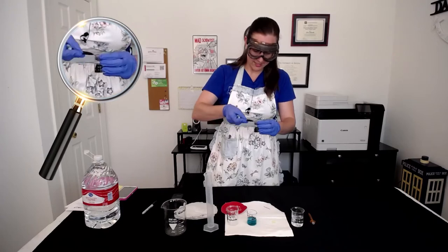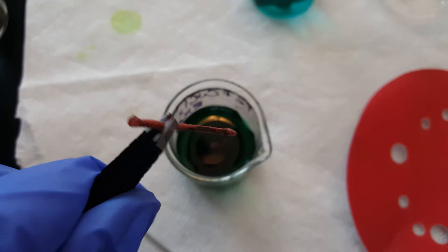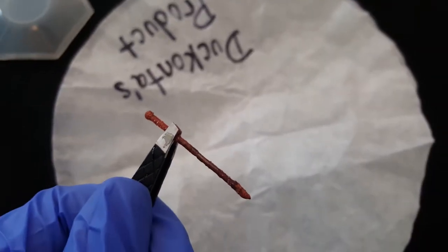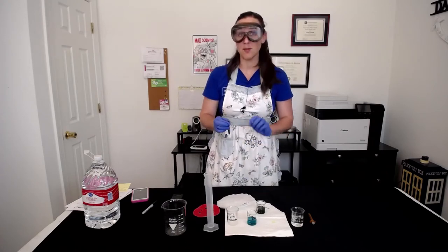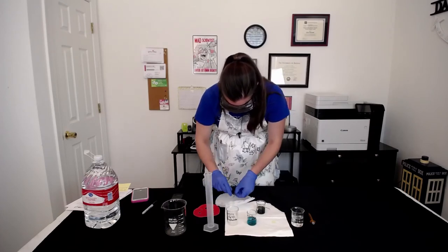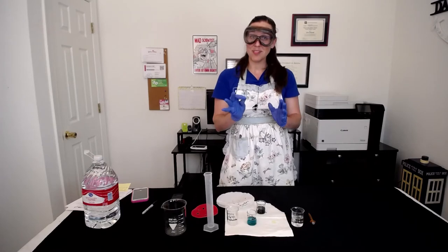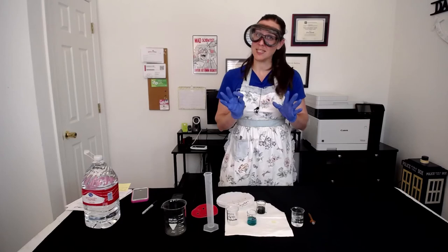We want to get all of the product off this nail as much as possible. Notice how much product is still left on the outside of this nail — we don't want to waste any of that. We want to make sure that we can get as much of it into our solution or onto our product paper. I'm just going to scrape off as much of this as I can onto my weighed filter paper. You're inevitably going to lose some product here, but that's okay — we can talk about that in the error analysis. Now that we've removed as much product as we possibly can, we're going to set this nail aside and let it dry overnight before we take its final mass.